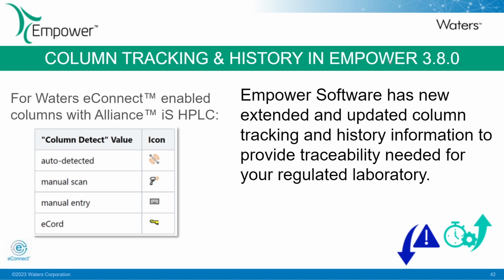Empower then reads that information and stores that information permanently. There's no human intervention. So at the end of the day, if somebody says, well, what column did you use to make this injection? You can show them without a doubt, this is the column that I used.